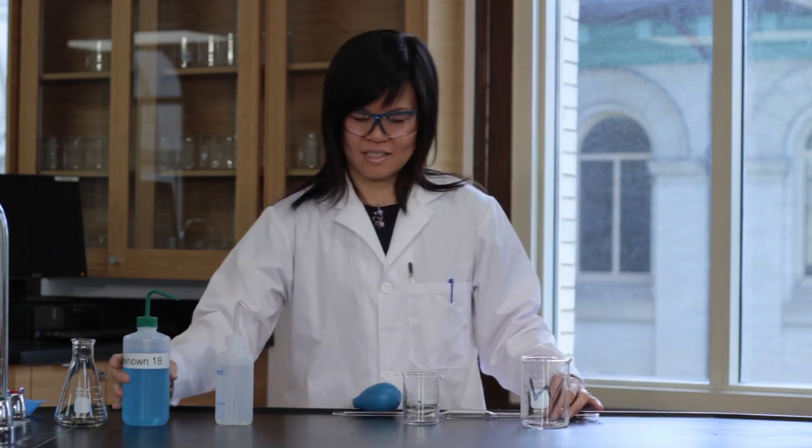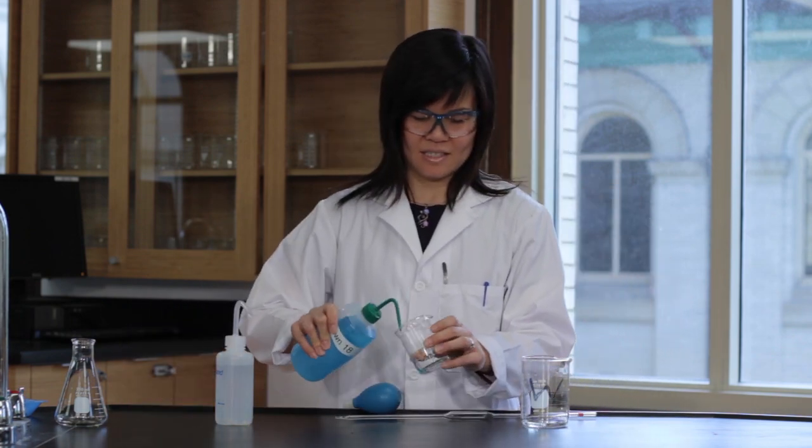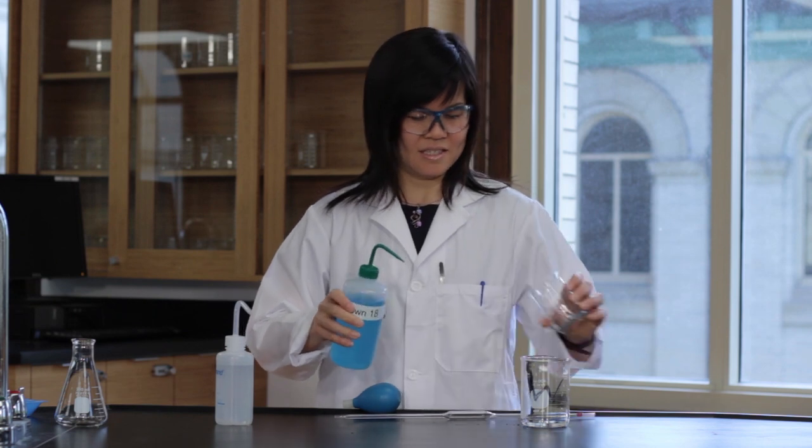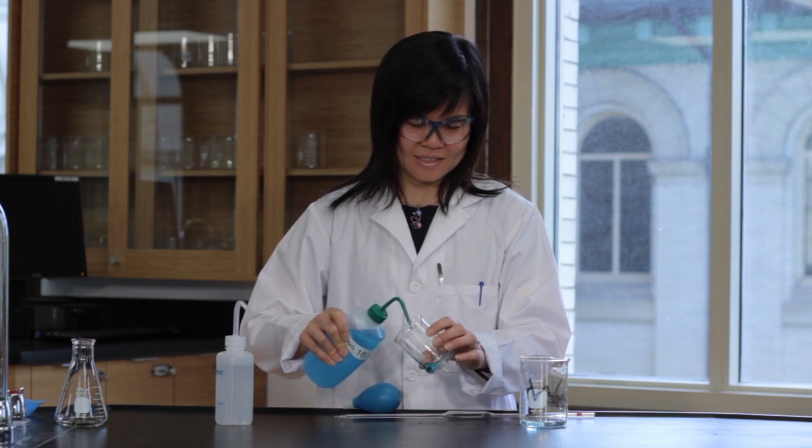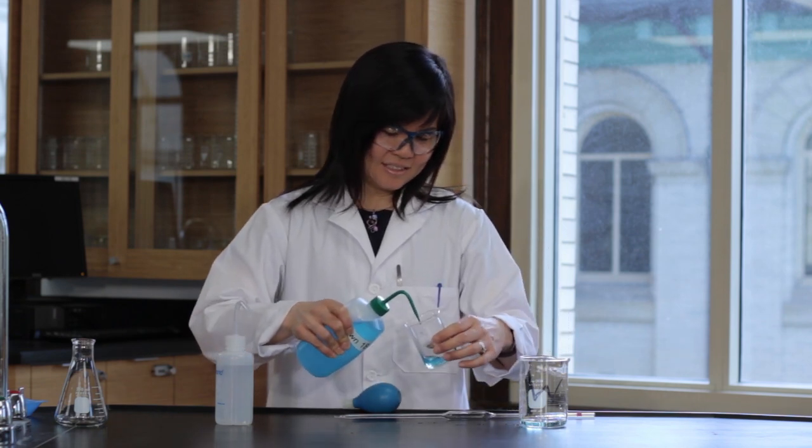Now rinse a small clean and dry beaker with a small amount of the solution to be pipetted. Discard the rinse. Pour approximately 50 milliliters of the solution into the beaker and rinse the pipette twice with a small amount of the solution.